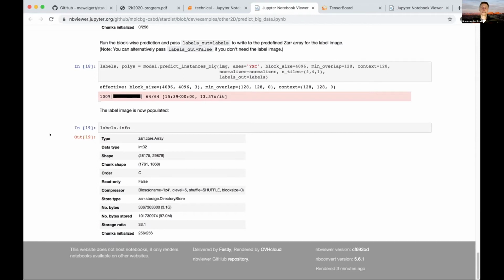Some of the stuff we use internally, but somebody else could potentially use it as well. We've never advertised it, because this tutorial was the occasion to actually make a notebook like this, since it's always work to even show how this stuff works. The stuff I showed in this developer-focused part is not as well documented, because it takes a lot of time to make it nice and user friendly.